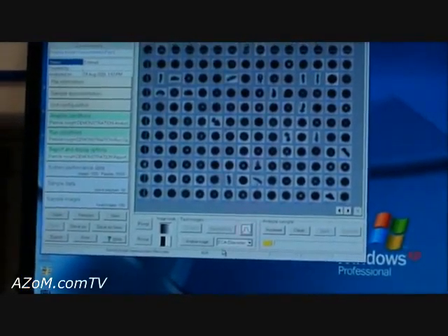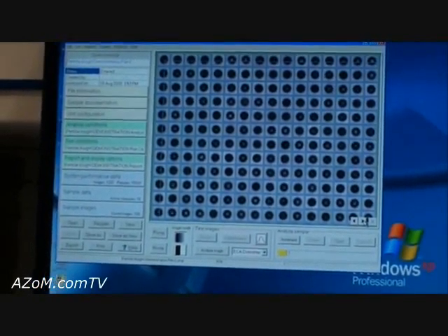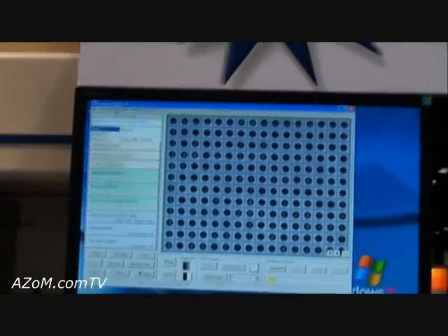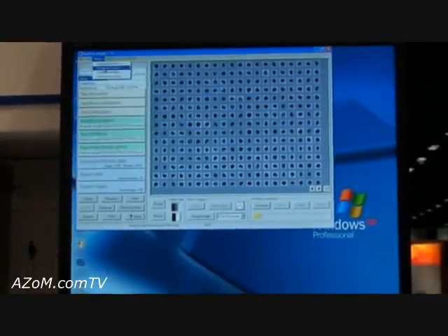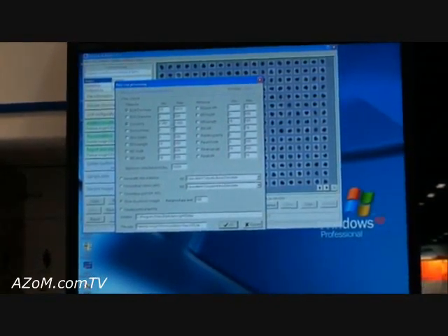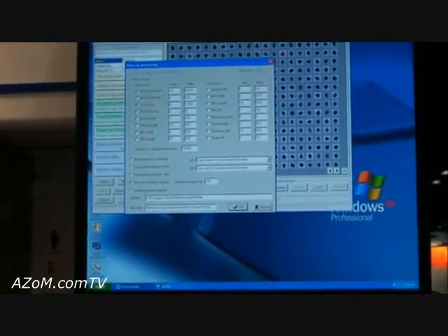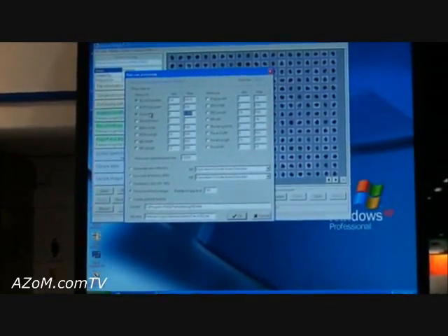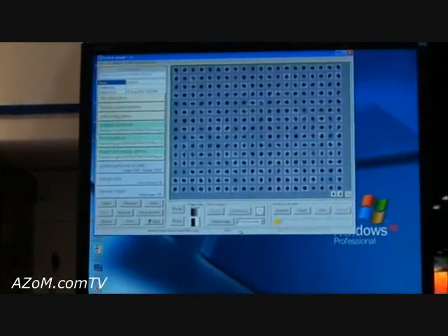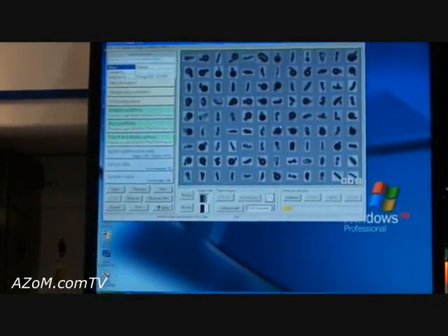And I'll actually get out of the 15,000 particles, I will sort out only the ones that are spherical. Going the other way, you can actually just say, well, I'm not interested in seeing anything that's a sphere. Just show me the things that are the other way. Show me the things that are not spherical. So I can just say, well, I will then look at every particle that goes from 0 to 0.7, 1 being a perfect sphere. And you'll start seeing things that are definitely not spherical.